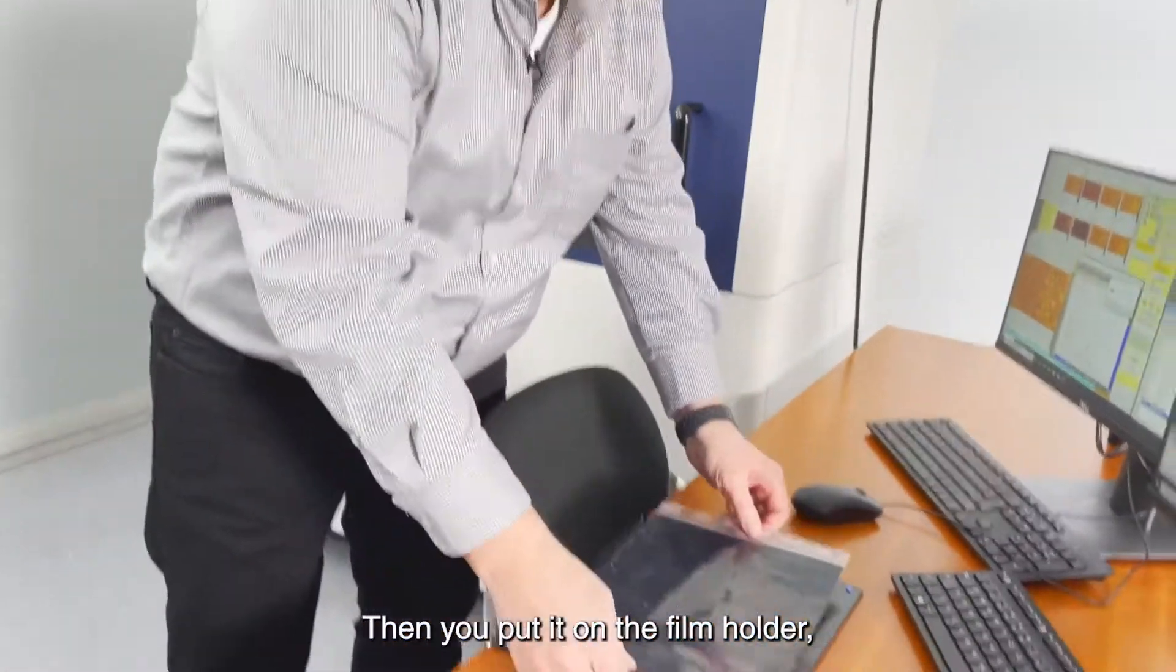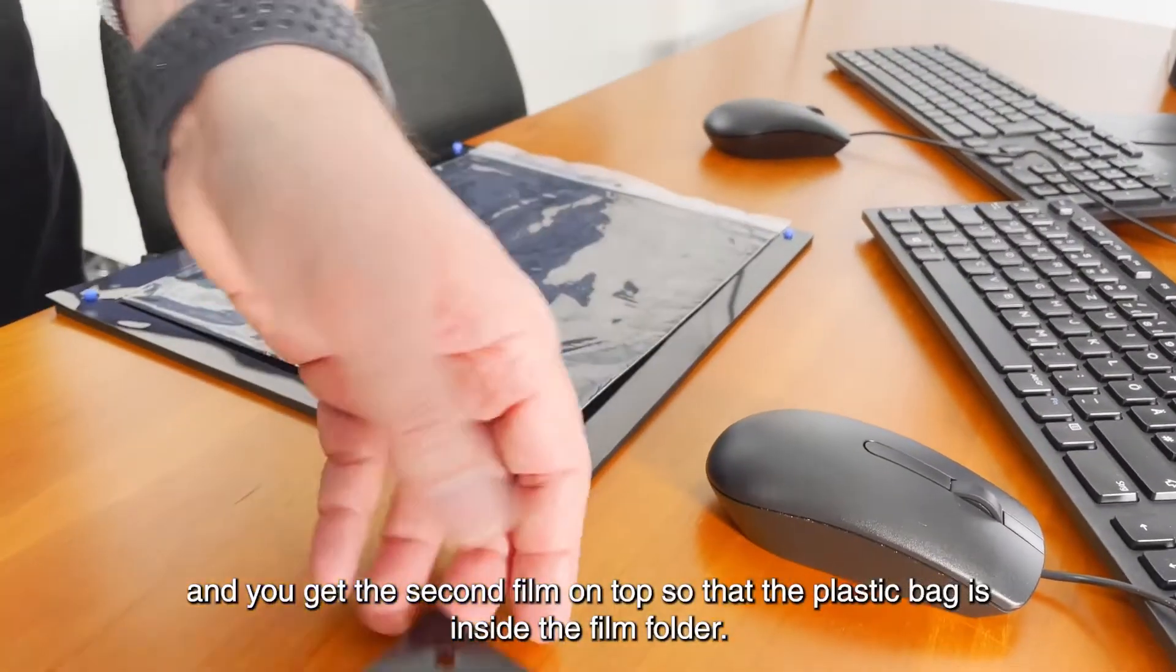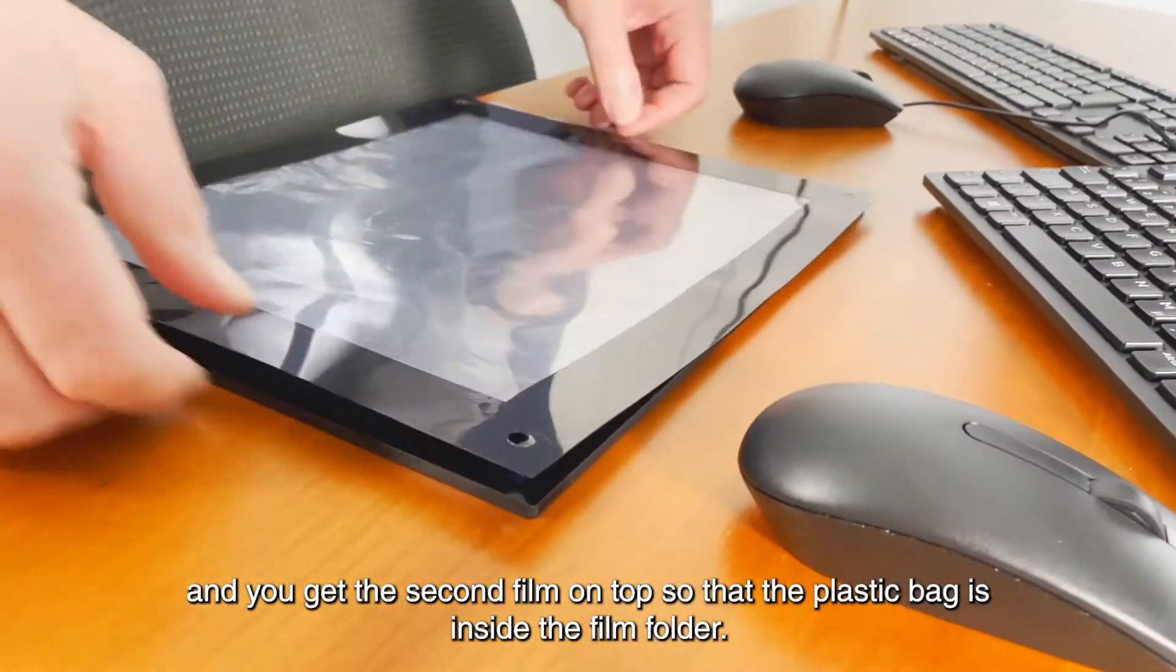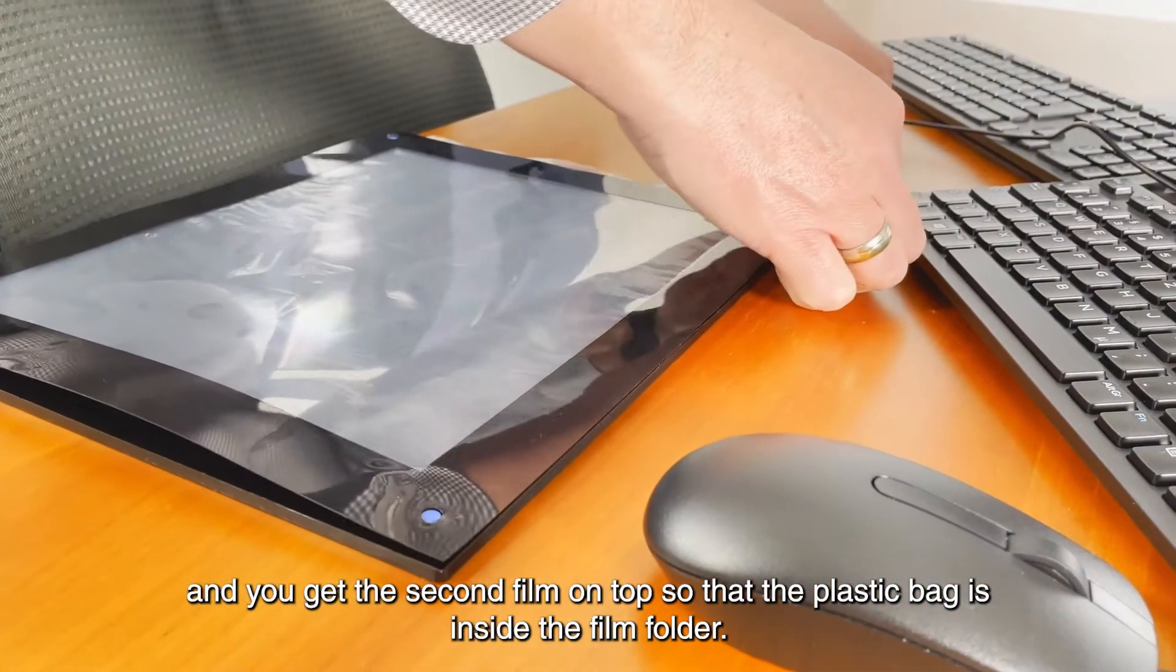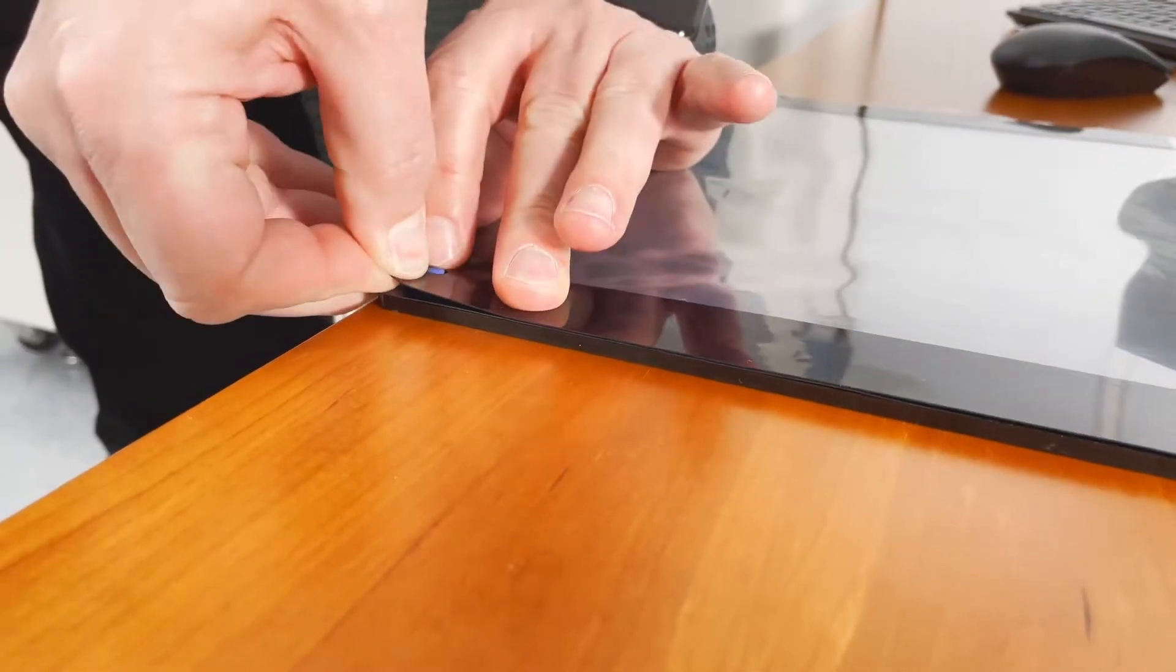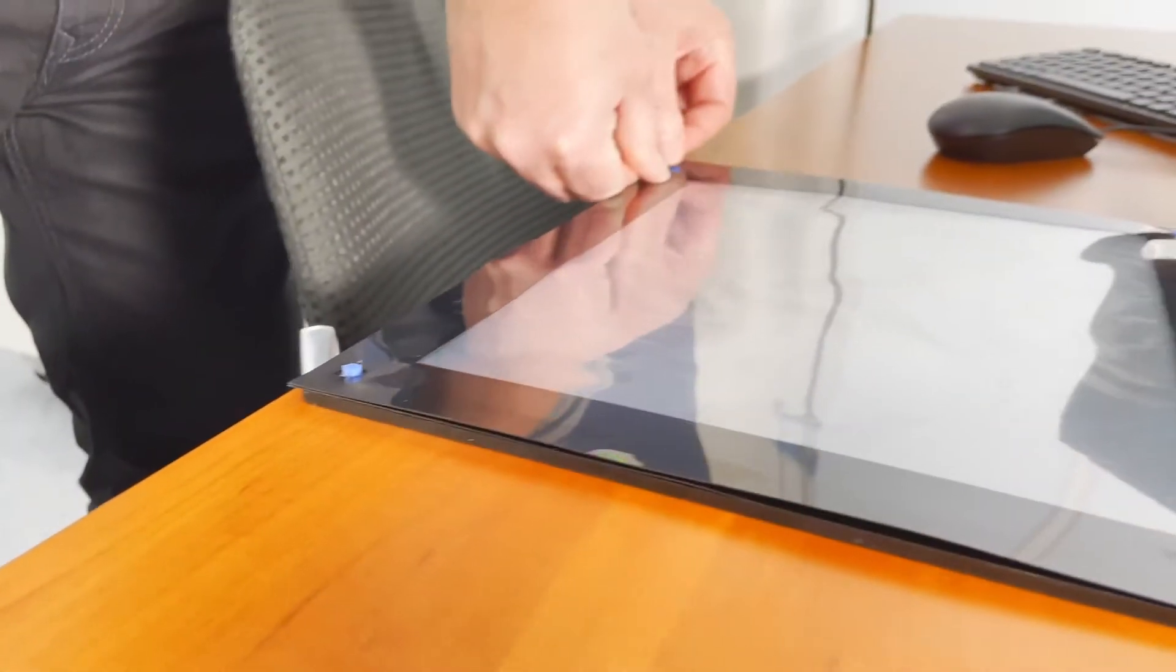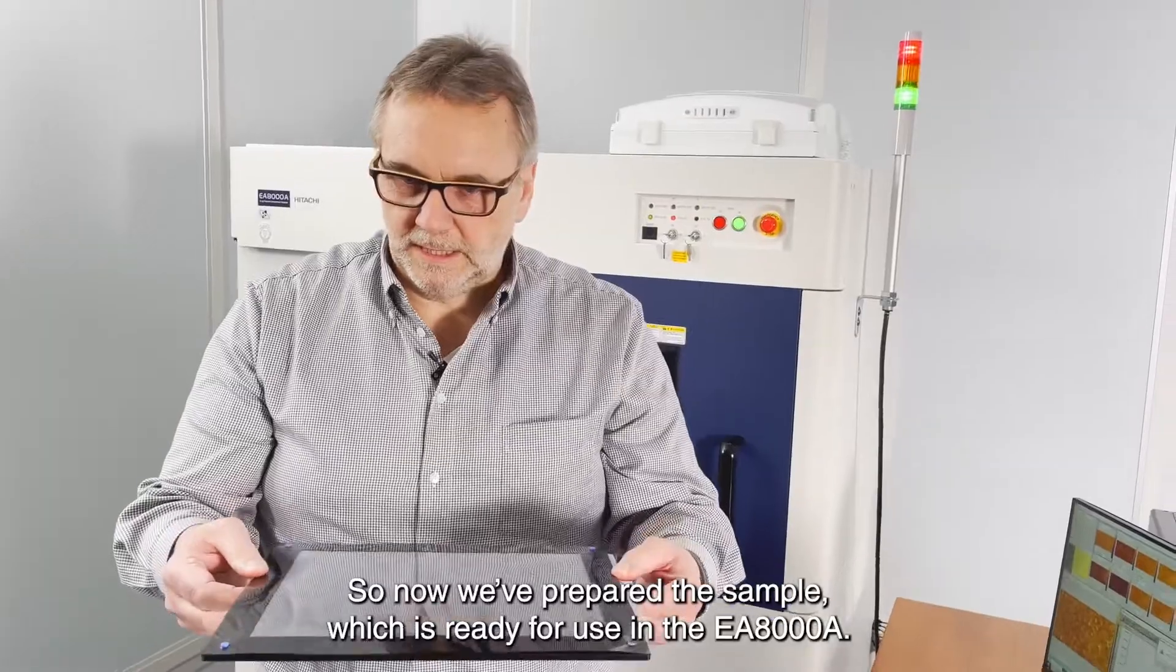Then you put it on the film holder and you give a second film on top so that the plastic bag is inside the film holder. So now we prepare the sample which is ready for use in the EA8000A.